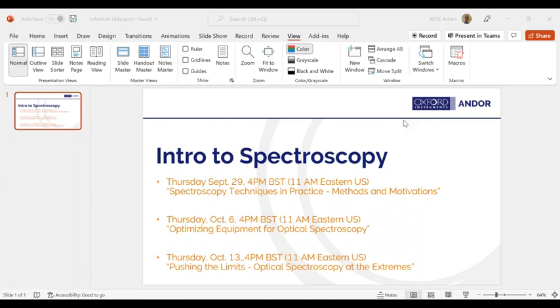Question again about heavy metals. So heavy in the sense of density, like high atomic number. I covered a ton of stuff very superficially. For working with metals, it's less likely you'd be able to do a lot of UV-Vis type measurements on, say, telling steel from nickel, or different compositions of steel. Typically for metals, you could look at something like optical emission spectroscopy, where you put some energy into the surface of the metal, either electrically or with a laser, and you look at the atomic emission lines from the atoms that are present in there.